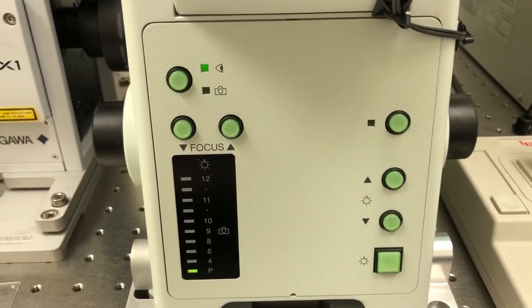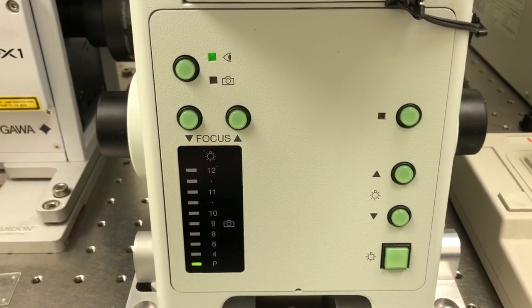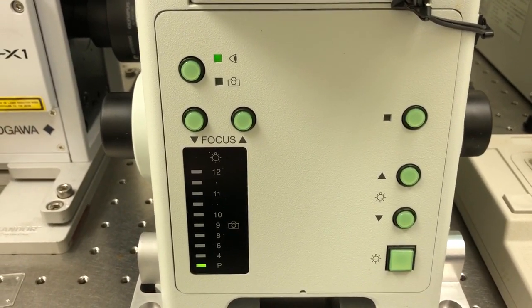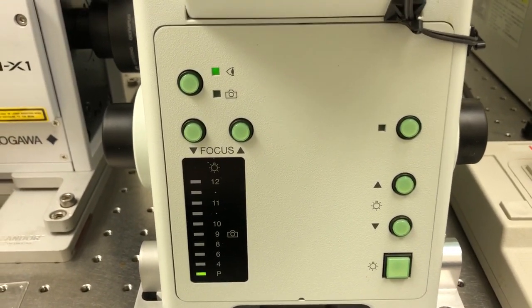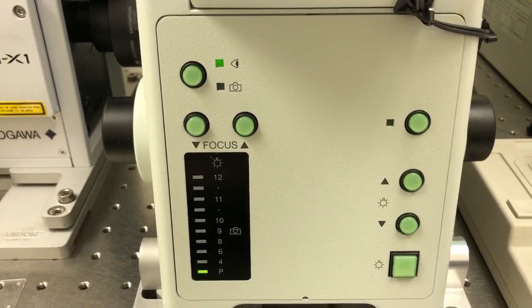There are a number of other buttons on the front of the microscope which I'll go over very briefly so you know what they do.